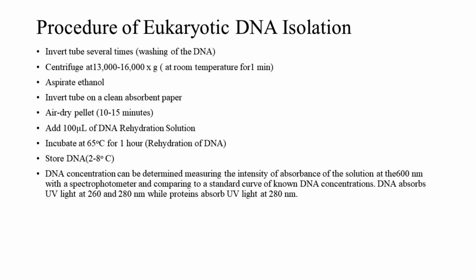Centrifuge at 13,000-16,000 xg, at room temperature for 1 minute. Aspirate ethanol. Invert tube on a clean absorbent paper. Air dry pellet, 10 to 15 minutes. Add 100 µL of DNA rehydration solution. Incubate at 65 °C for 1 hour, rehydration of DNA.